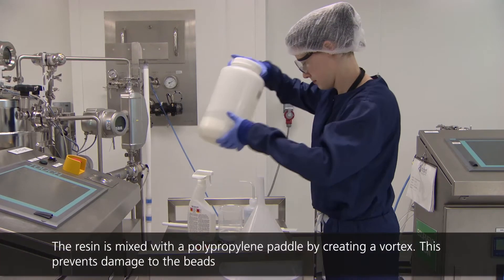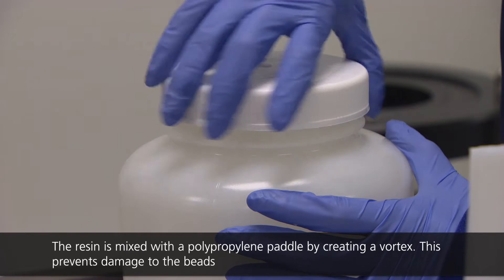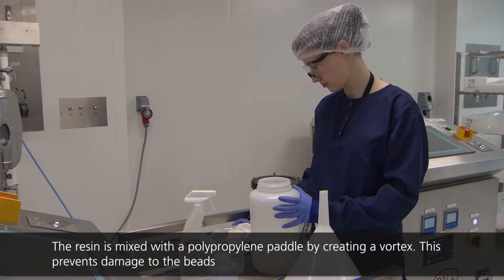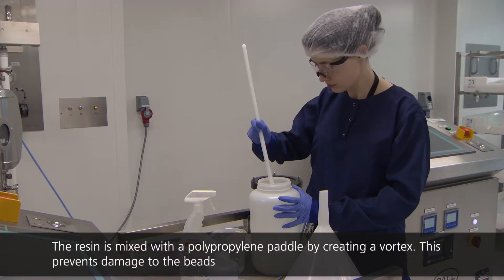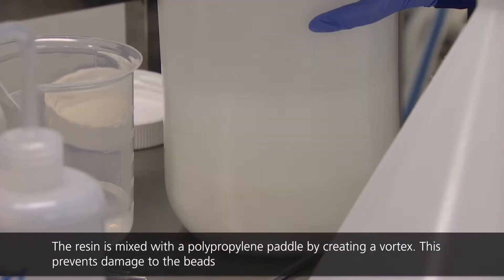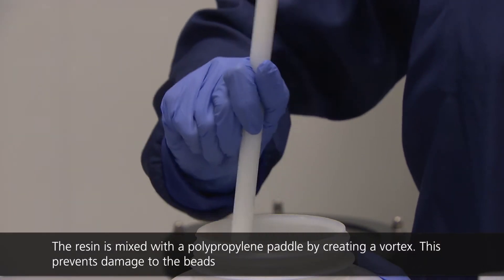In order to pack the column, the operator must mix the resin to form a slurry suitable to be poured into the column. To mix the resin, a sanitized polypropylene paddle is used to create a vortex above the settled resin. The resin is then carefully brought into suspension using the paddle, with care taken not to damage the resin beads.